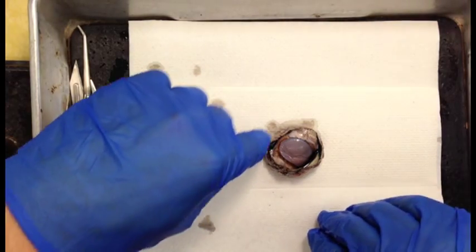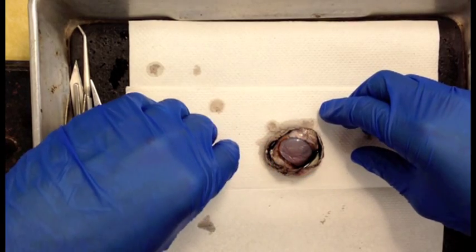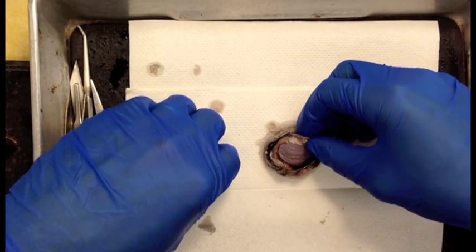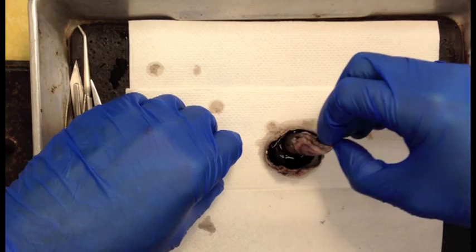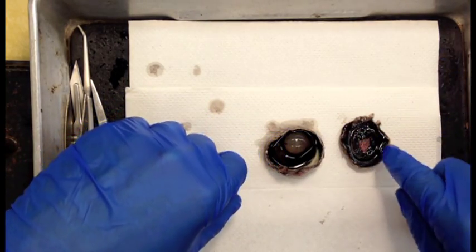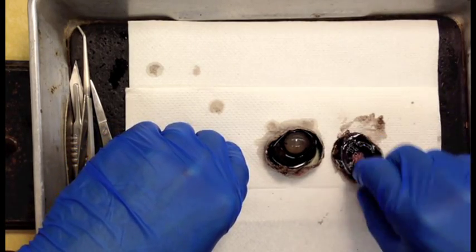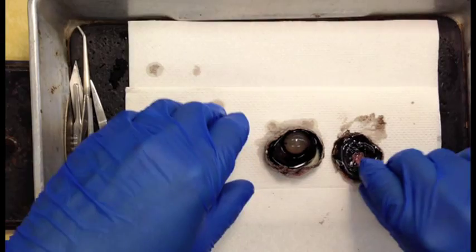Okay, so I just completed cutting a frontal section through the eye. So I now have an anterior portion and a posterior portion. So I can go ahead and lift off the anterior portion. You can see the cornea here in the middle. And we can flip it over and we can look at it from the inside of the eye.